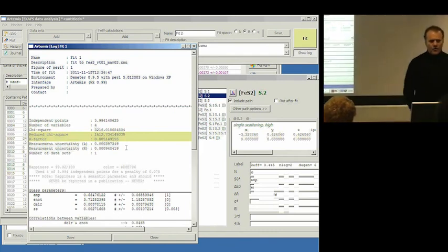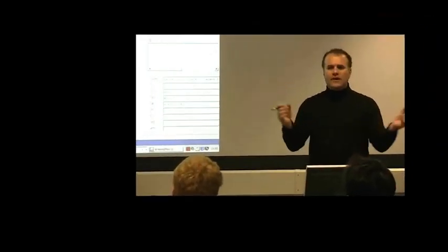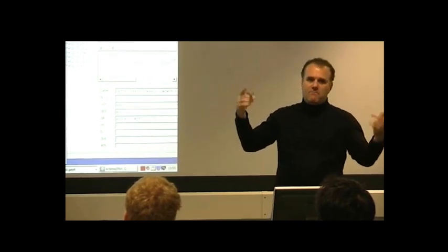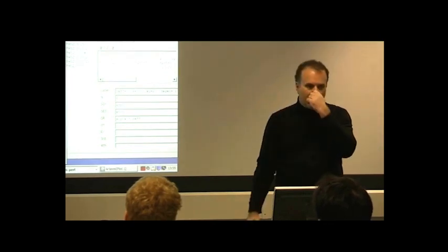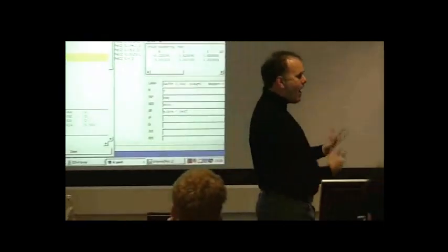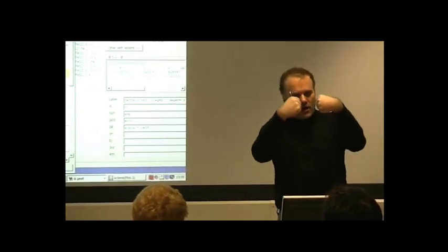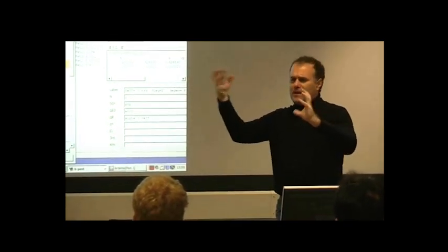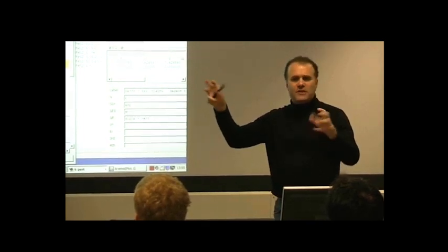Sort of the one thing that's probably true is that things that are farther away will have a somewhat larger sigma squared. That is, the mean square variation in a longer bond length is likely to be bigger than the mean square variation in a shorter bond length, except it really has to do with how the atoms are all fastened together. So often you see a situation where the nearest neighbor is quite stiffly bound, strongly bound, and therefore has a relatively small sigma squared, but a more distant neighbor might be part of some other structural unit in the material, and the relationship between those two things might be a lot floppier.